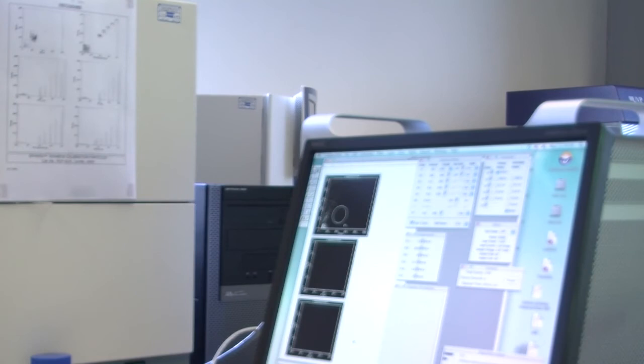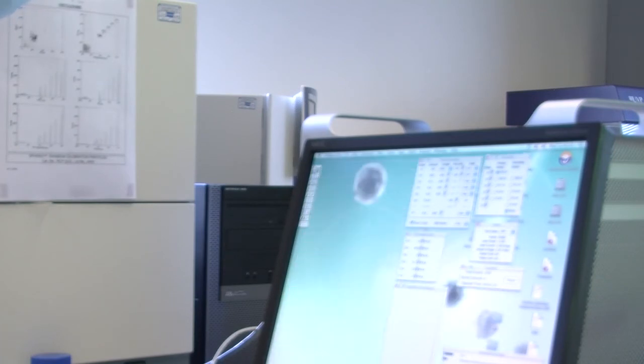There's some top ones and little sorting top ones. They're the ones I've been using, but for today I'll just. What was the difference between them? We're doing each other's cells then.